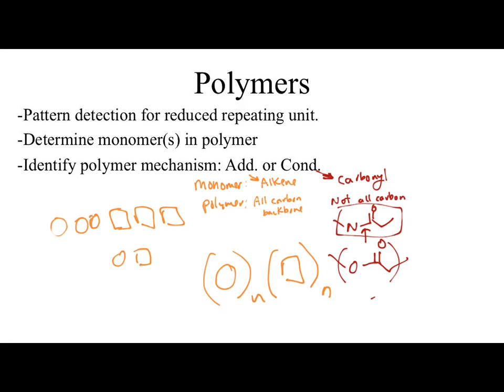Okay. What else was really important when it came to the nylon lab? The 2 phases. Okay. You controlled how the polymer was formed by having the polymer only form at the interface between those 2 phases. So you made sure your reagents were in 2 separate phases. Okay, so that was pretty huge. Okay. Other than that, I think the polymer lab is pretty much beaten to death there. Other questions about it?